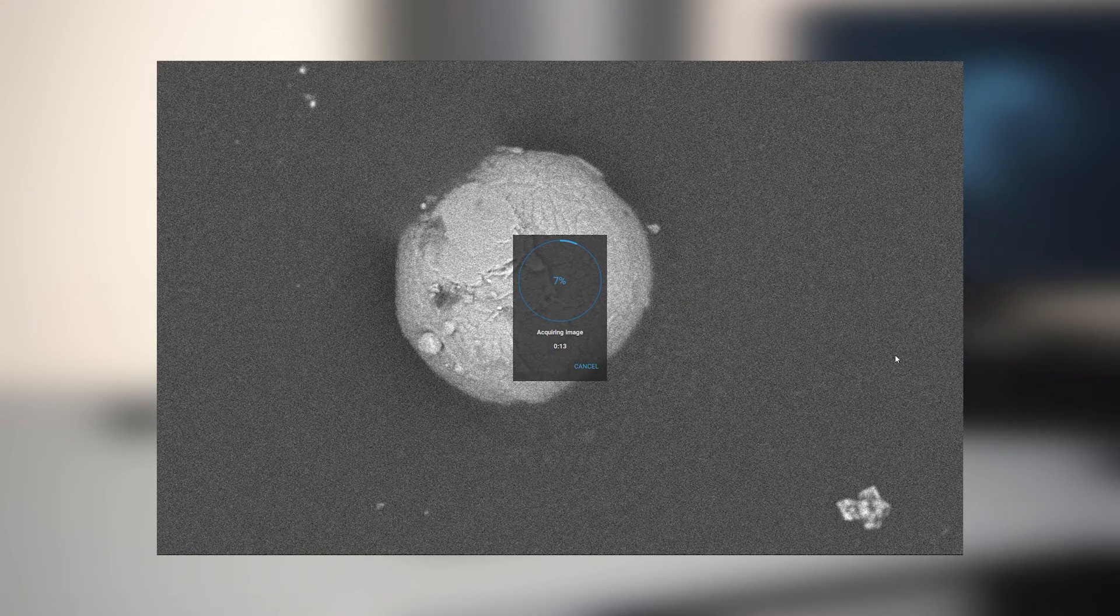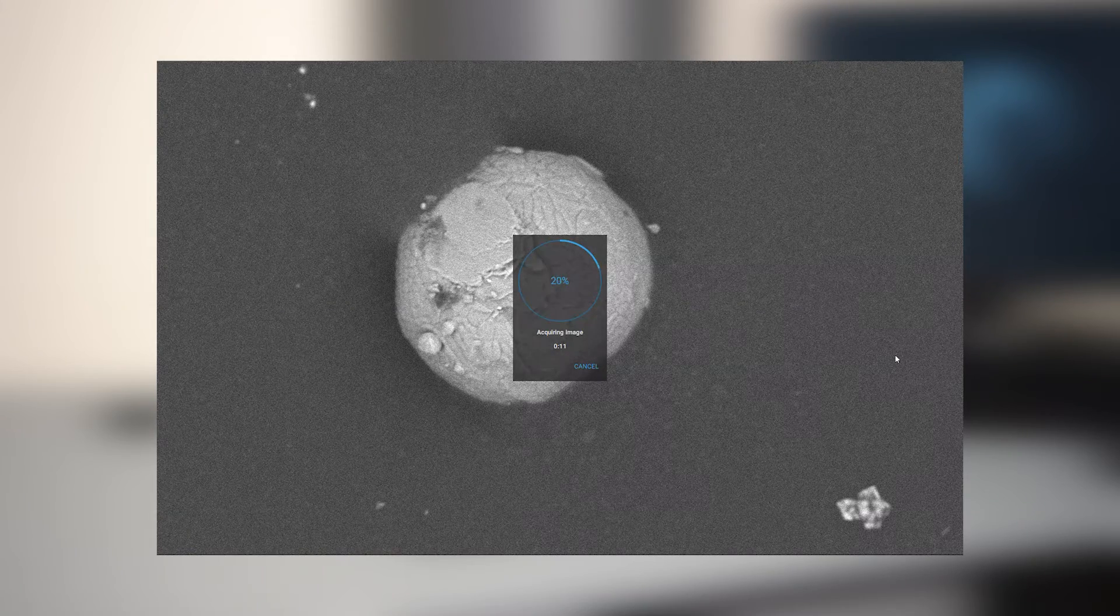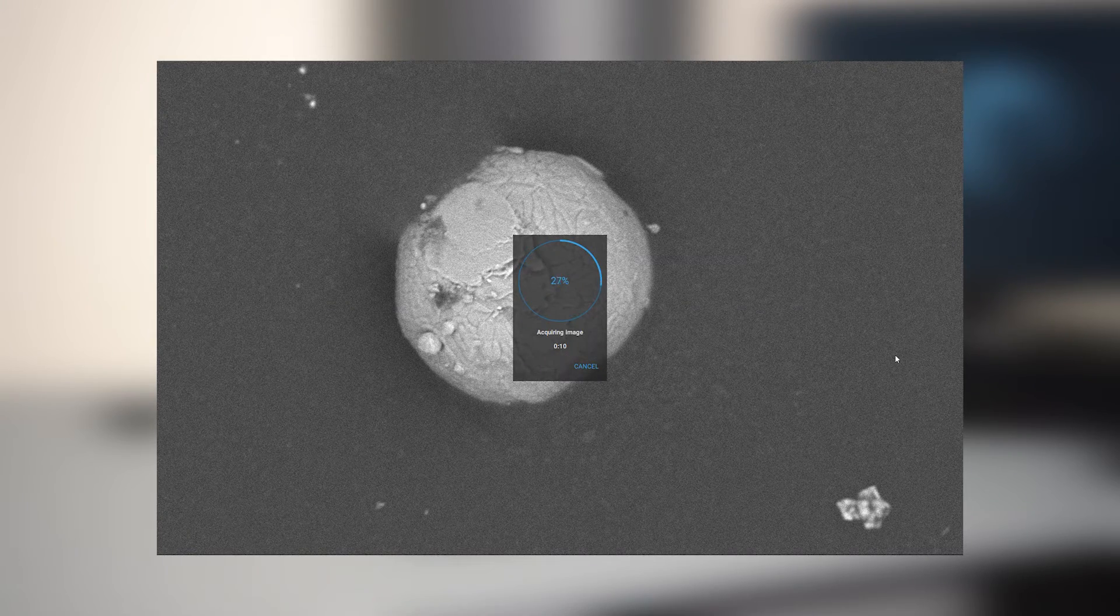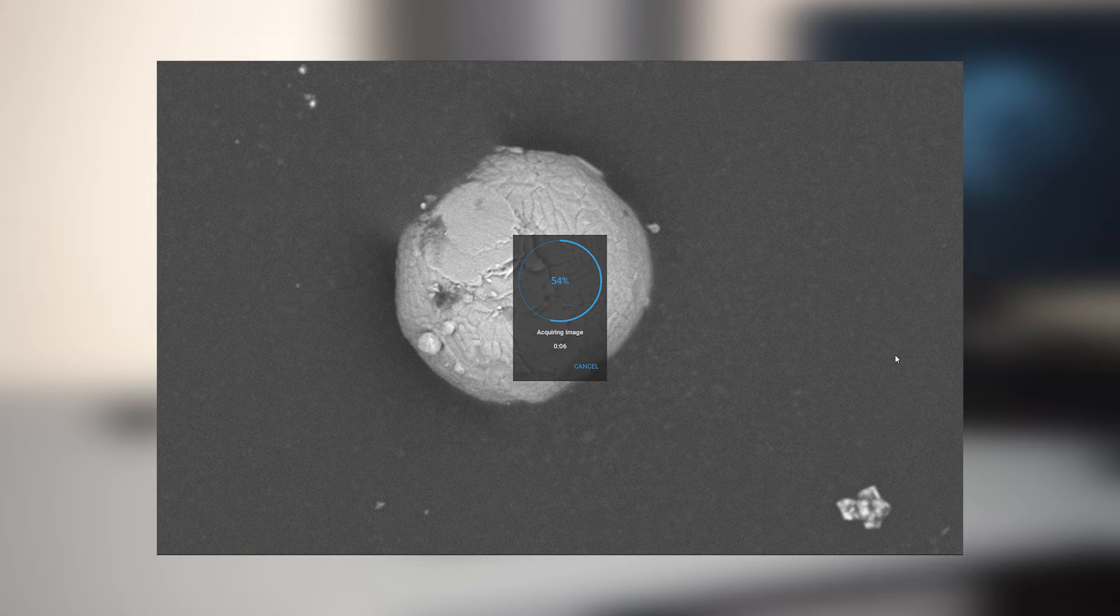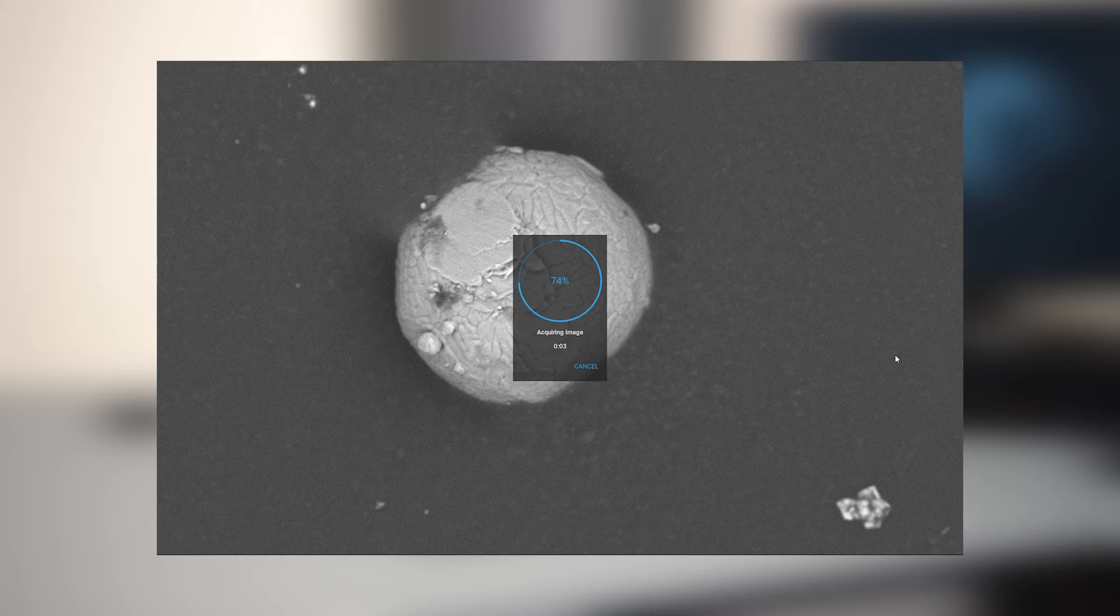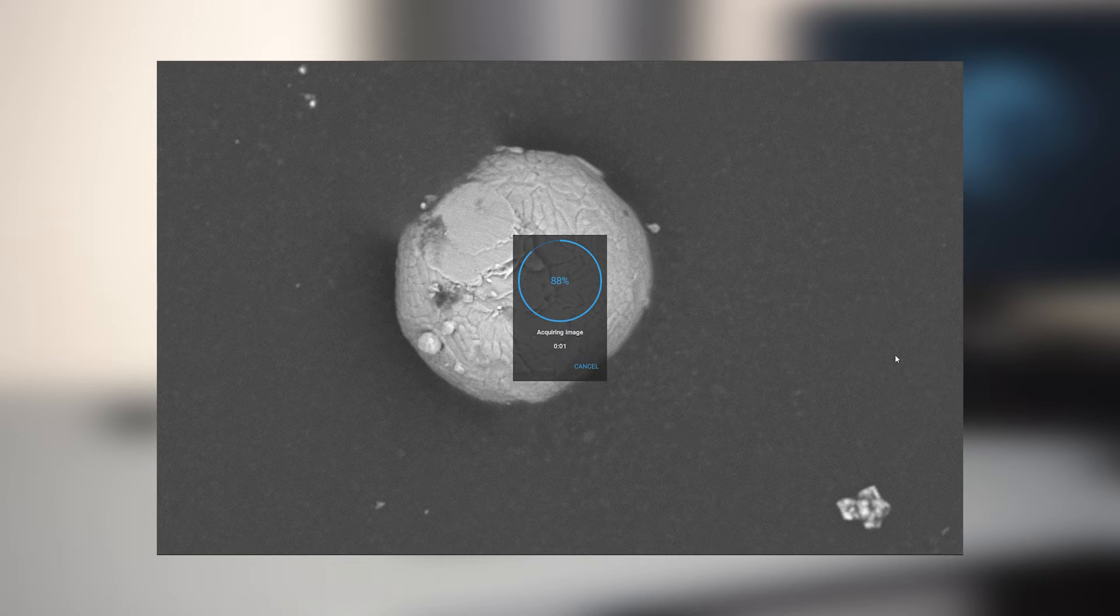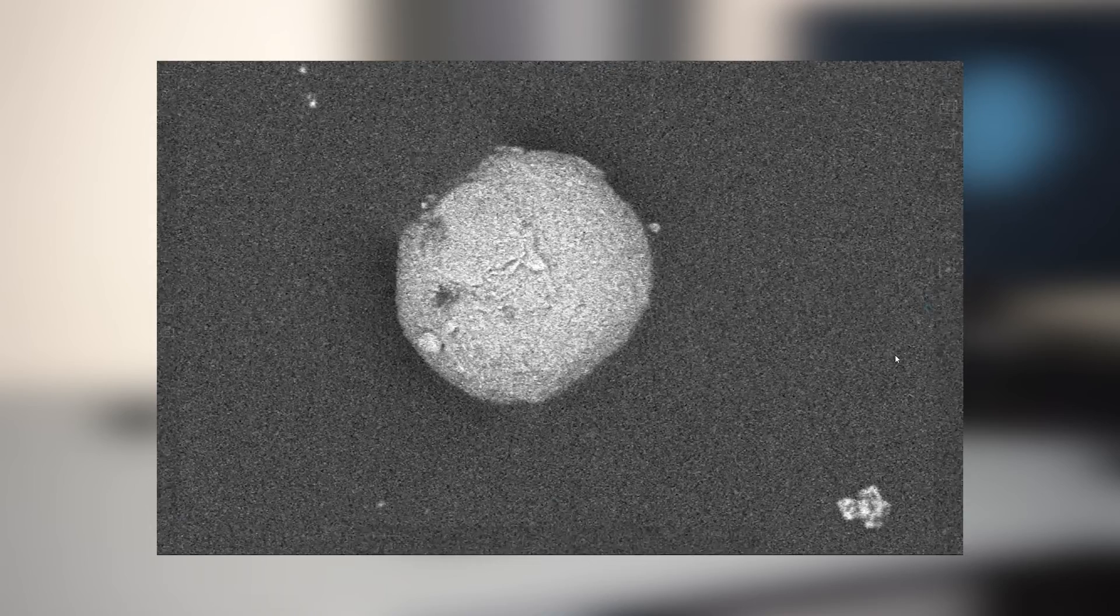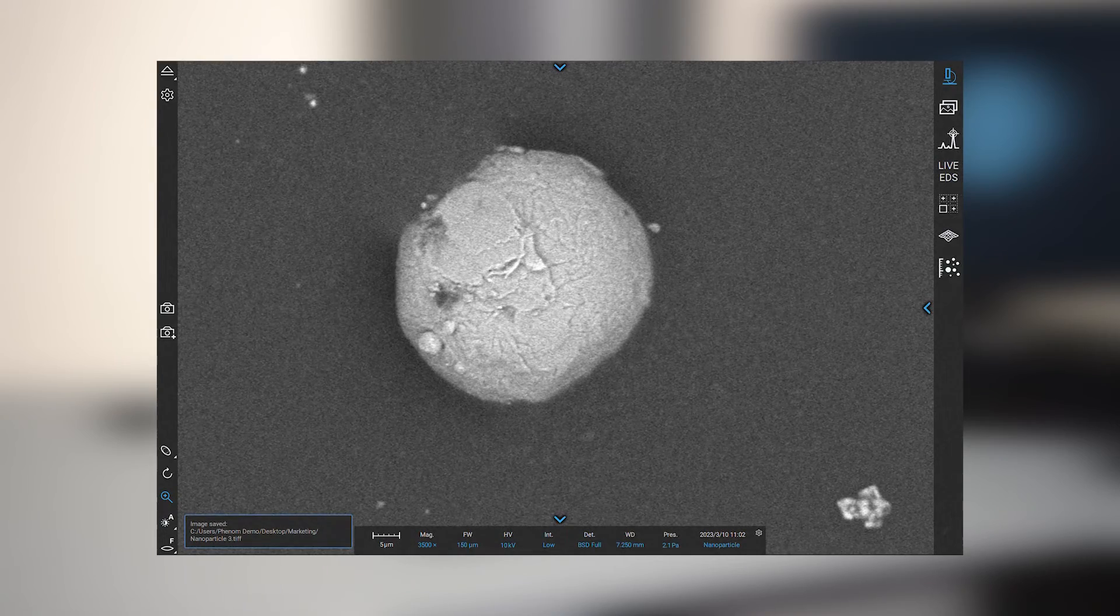When capturing this image there's some frame averaging happening to improve signal to noise ratio and give us the best quality SEM image that we can get. And that image is automatically saved to the gallery.